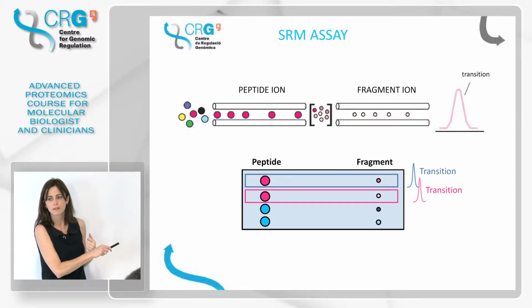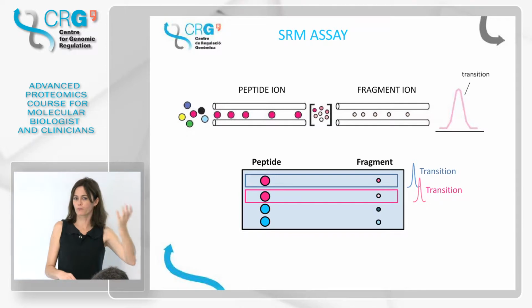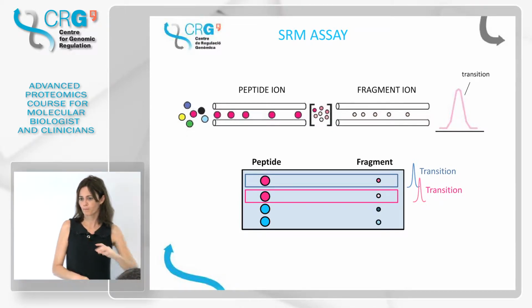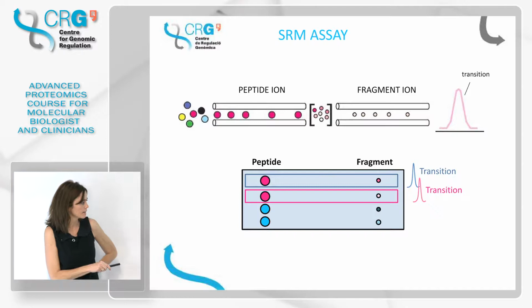From one protein? Or another one. Oh, okay. Can be all from the same protein or not. No, I mean the coeluting one. The ones that coelute are always from one peptide. Yes. Okay. Yes.